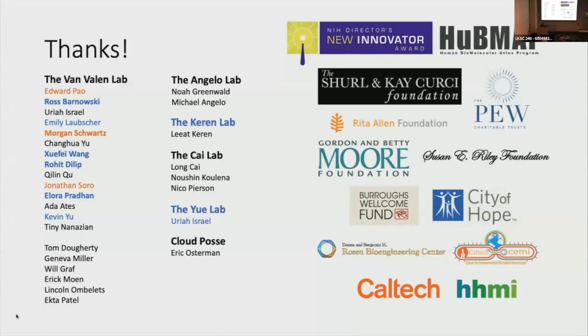And then how does the DeepCell Label human-in-the-loop approach differ from Cellpose2's approach of using different base models and training on small subsets? Yeah, that is a good question. One, I would say the Cellpose human-in-the-loop approach was inspired by what we originally did with Mesmer.